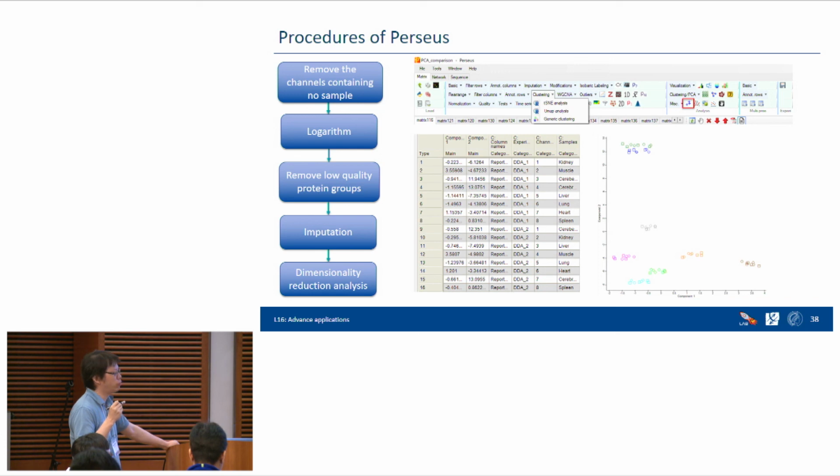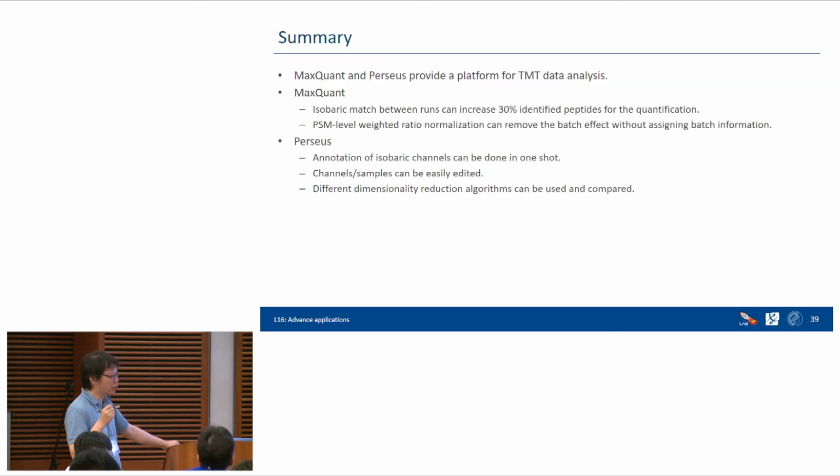You can increase the number of components. I think most of you will change this, okay? And you need to see that this button should be green. If it's red, that means there's something wrong in the setup of your R or Perseus R. If you have any questions about how to make this button become green, you can come to us at lunchtime and we can help you.